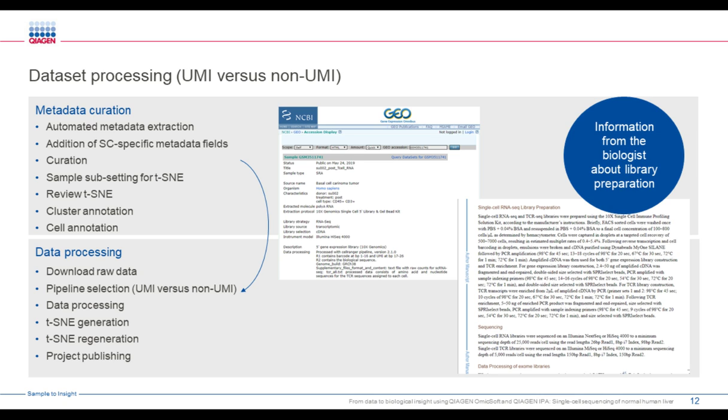The data processor will run a differential expression analysis using Seurat to identify the top differentially regulated genes between the different clusters, and these cell-specific signatures can be used to identify cell types and differentially expressed genes as well. These data are entered into the Land repository.